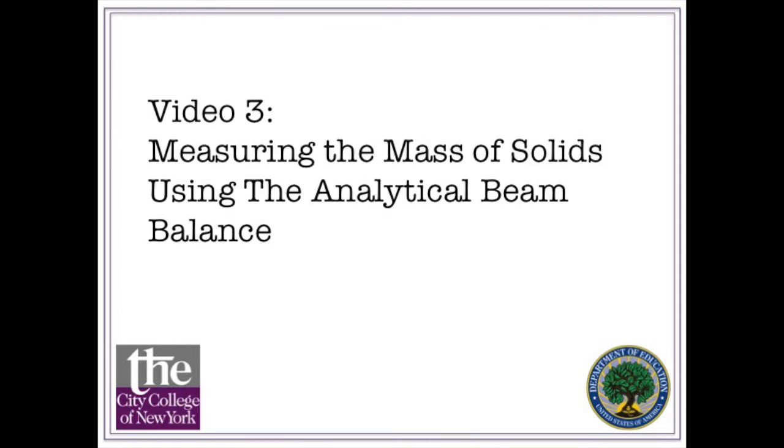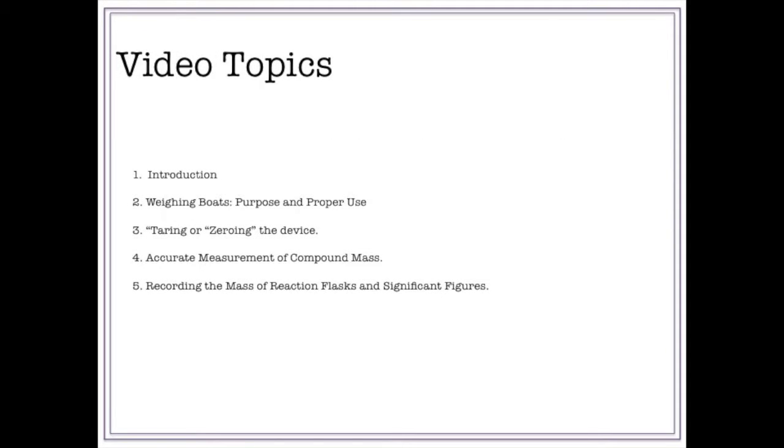Video 3: Measuring the Mass of Solids Using the Analytical Beam Balance. Topics covered in this video include an introduction to the instrument, the purpose and proper use of weighing boats, taring or zeroing the device, accurate measurements of your compound's mass, and recording the mass of reaction flasks and using significant figures.